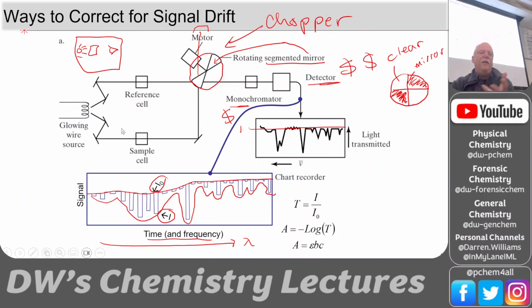That's really important. Many spectrometers will have choppers. This would be for a scanning instrument. Okay, I guess you could use it also for a diode array. Yeah.